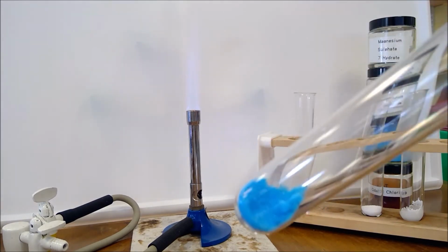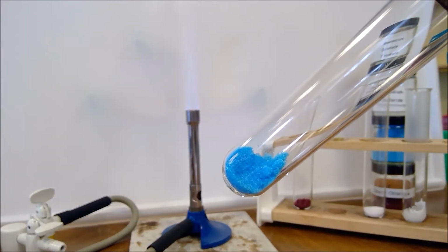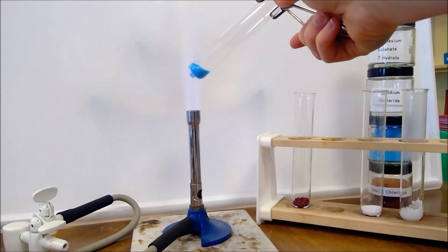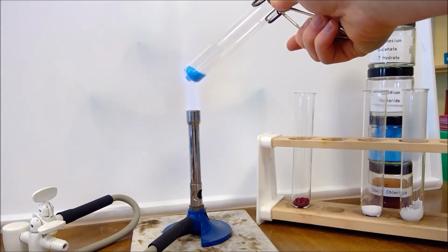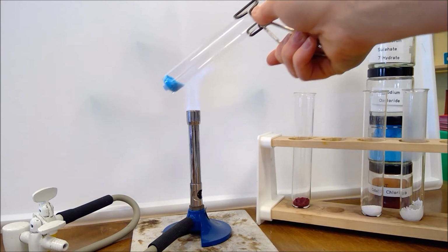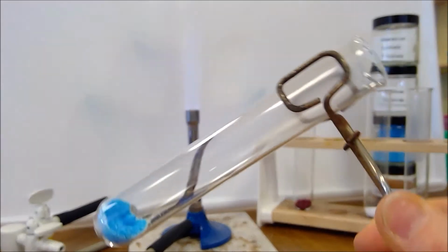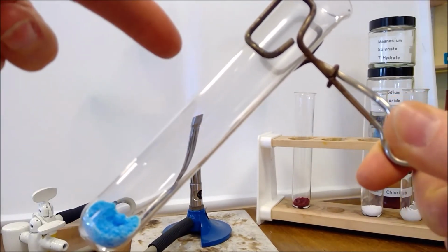This time we've got our copper sulfate, so record the appearance there. I think already we should be able to see some condensation on the upper part of the tube there.